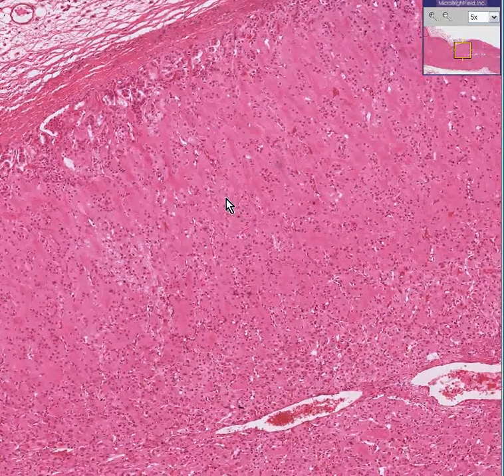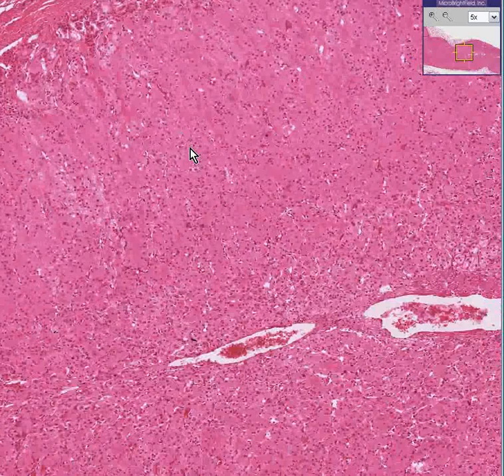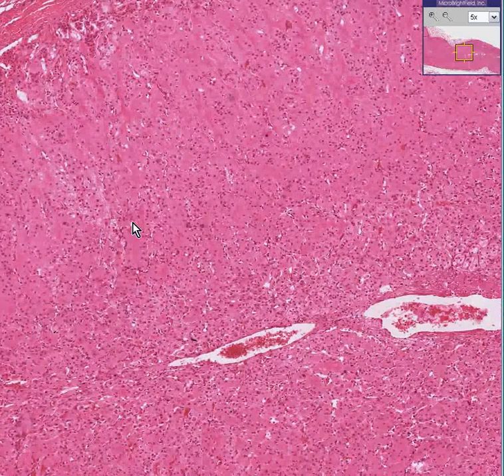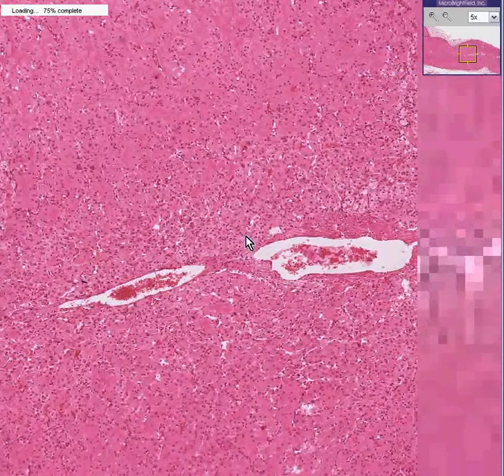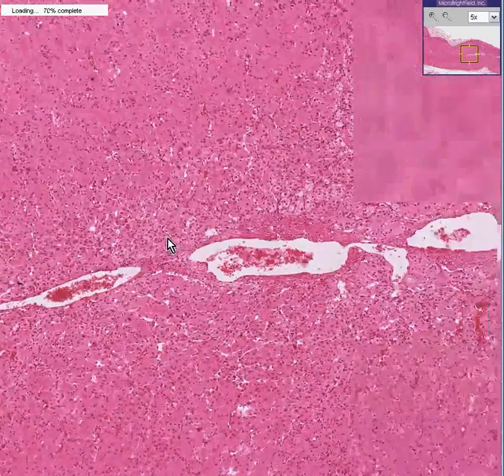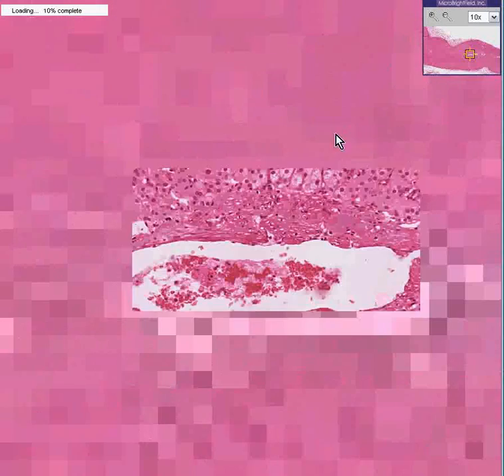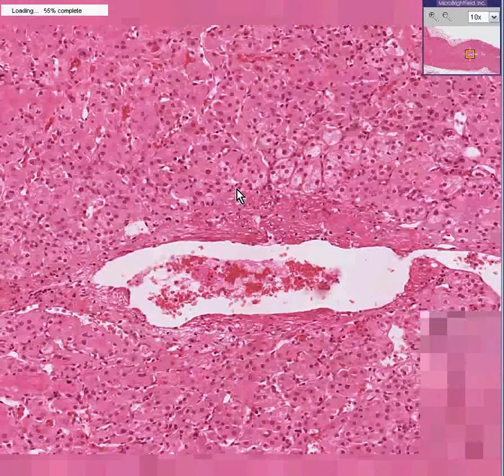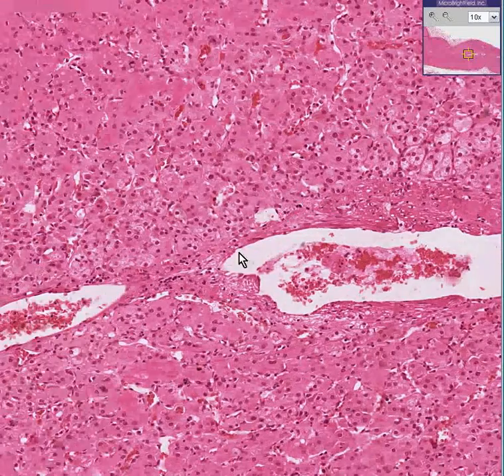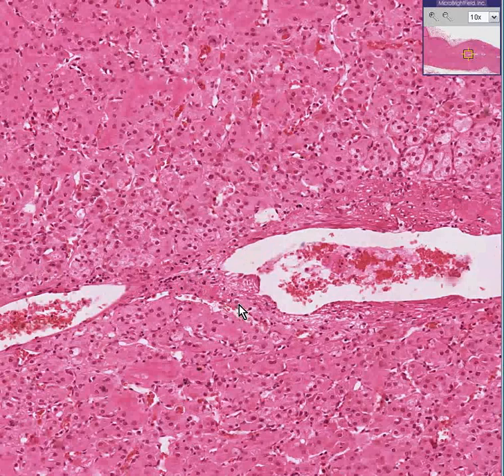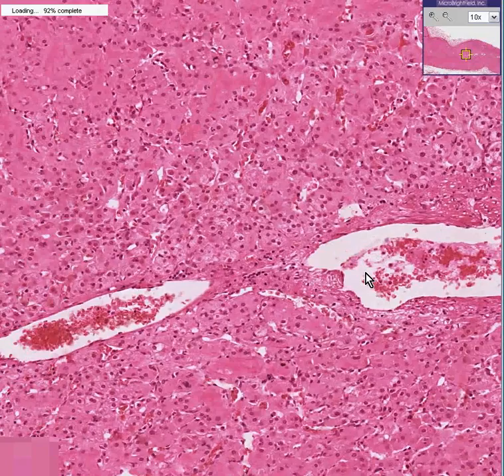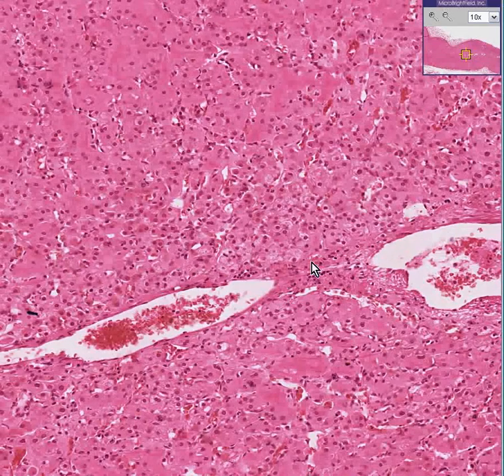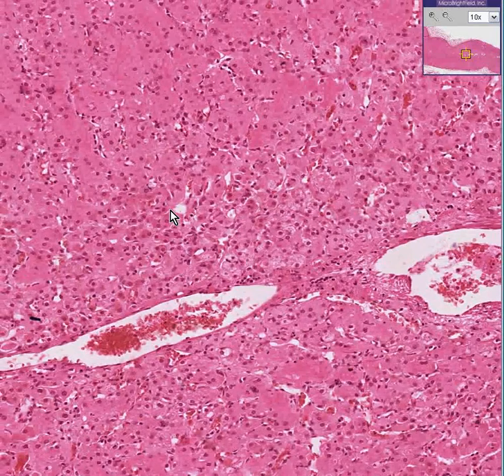Differentiation between the three layers is not always the easiest. In this case, it's not as easy to differentiate medullary tissue from cortical tissue. But when you get into these large veins lined by thick amounts of smooth muscle, that's the medulla.